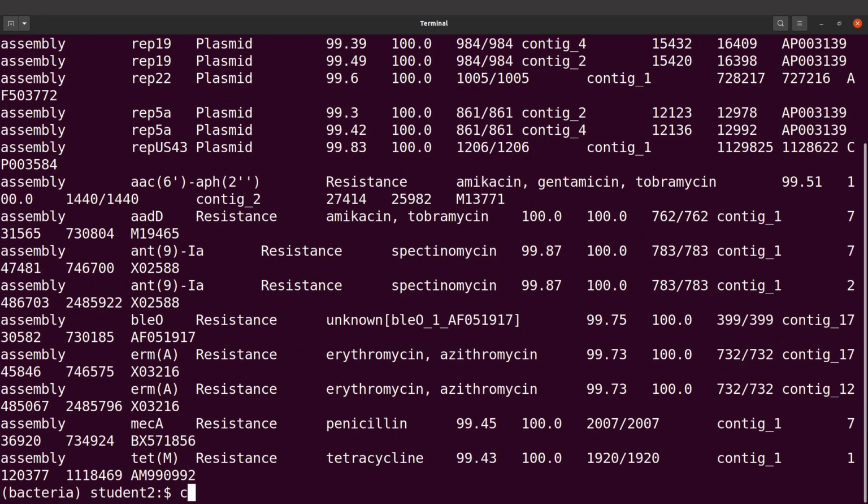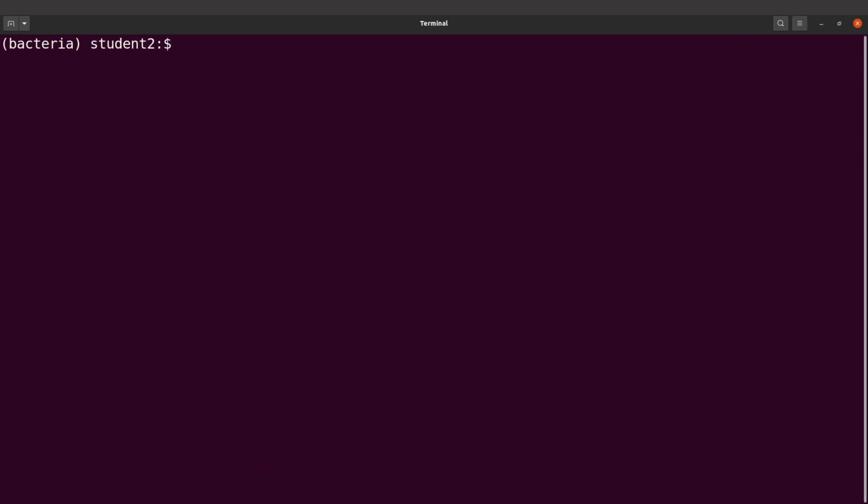All right. So we can also do a wc -l to count the lines. We have 17 of them. So we have 17 entries. That's what we have. All right. So let's proceed.